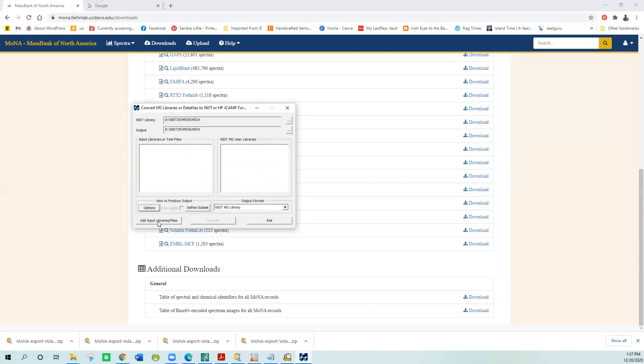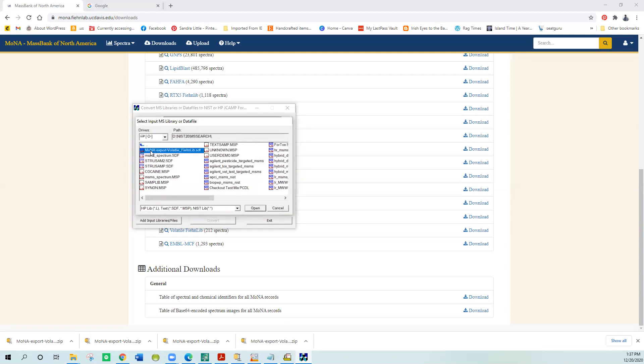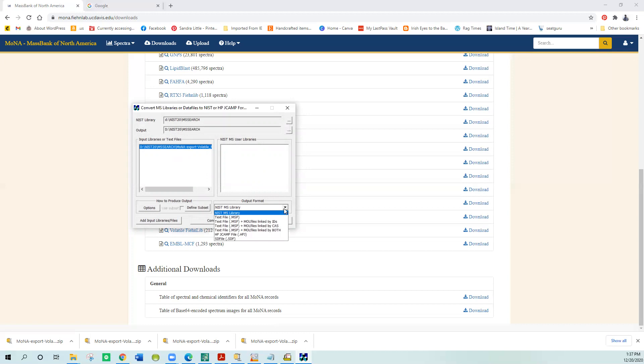Then I have to go find the file, so I add the input library. Here's the one I downloaded that I unzipped. You have to go unzip it first, but after you unzip it, you just select it, say open, select it again to show that's what you plan on converting. Then you have to decide which format you want. NIST MS libraries is the format we need for the binary format to actually work as a NIST hybrid library. Just say convert.